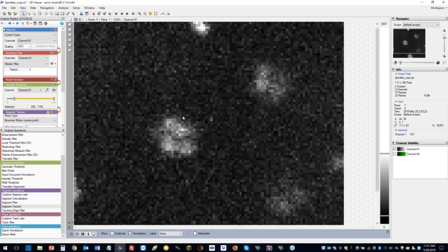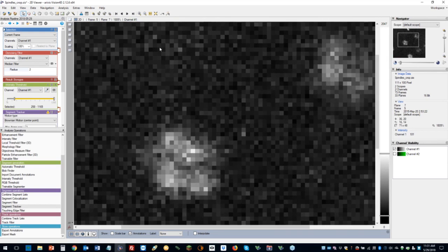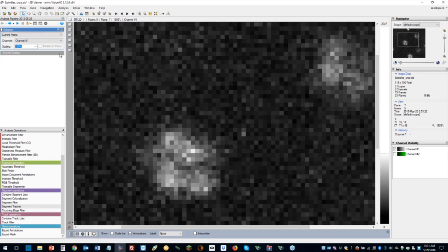Now we look at this image and we know that it has some sort of salt and pepper noise, and we want to remove it. How do we remove it? Well, we can begin to apply various filters. How the heck would you know what filter to apply ahead of time? There are two ways. One is you can go to the literature, study, talk to your colleagues, and really begin to make a real study of image analysis and become an expert at image analysis.